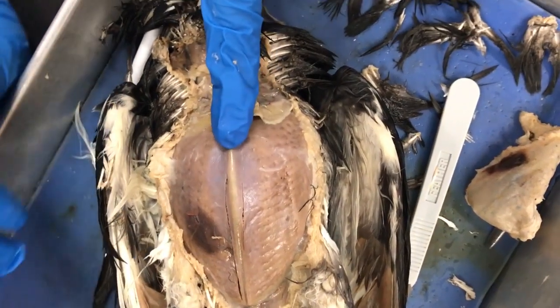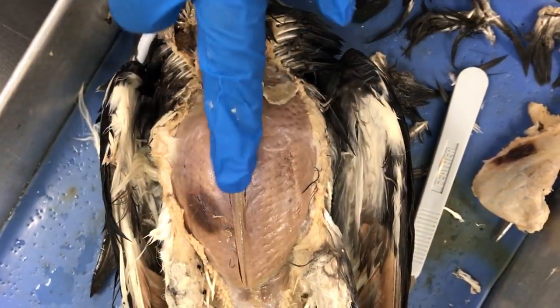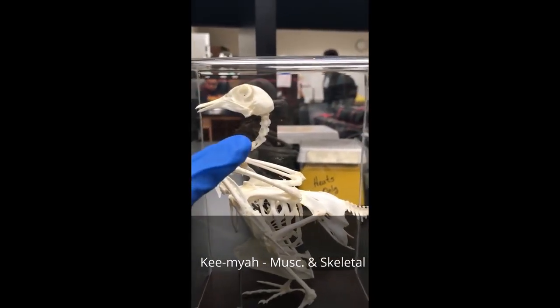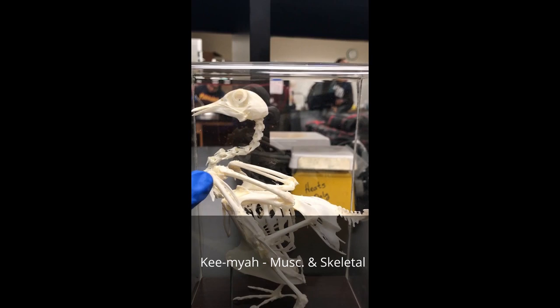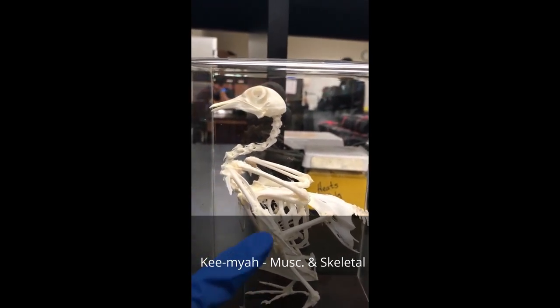So here, down the center, this is the keel, which is centered between the two pectoral muscles. So here on the pigeon, we have the cervical vertebrae. And on the wing, this is a wrist joint here with phalanges.